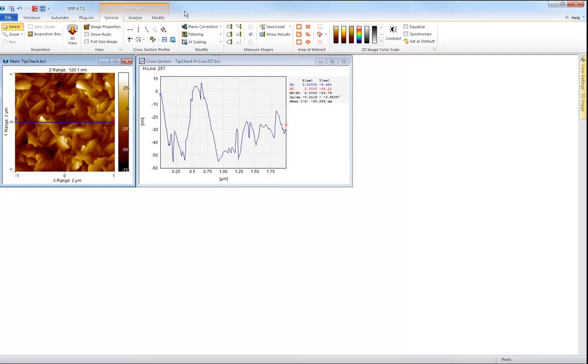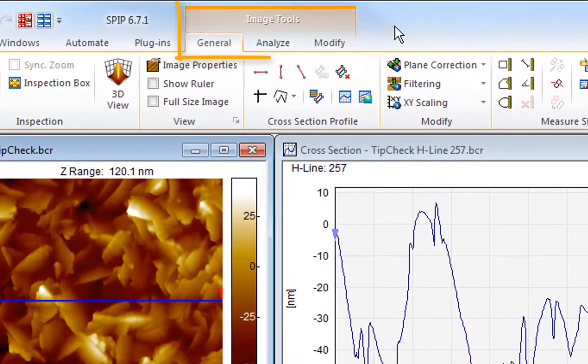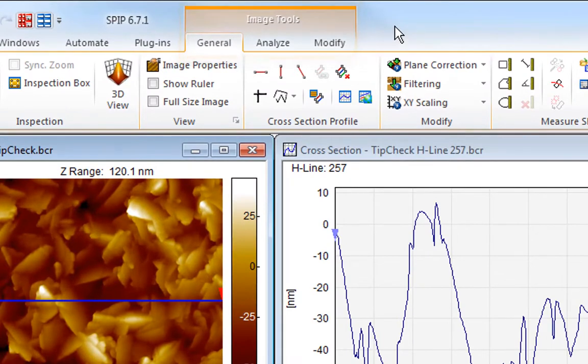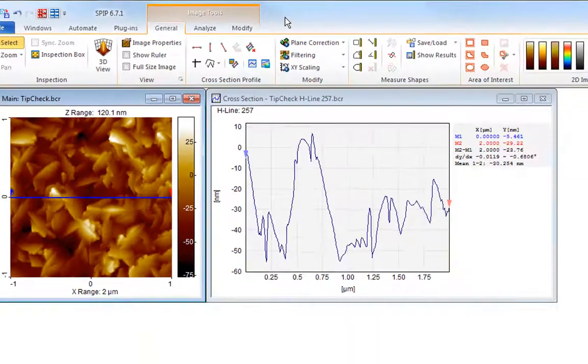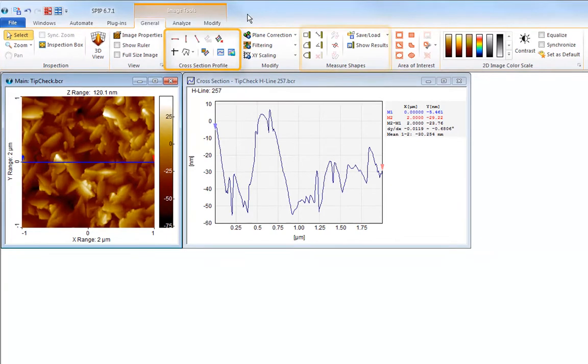In this case we see how the image tools group with the general, analyze and modify ribbon tabs appear when an image is selected. On the general tab we have all the interactive and visual tools such as zoom, cross section, profiling, measure shapes and color scale selection.